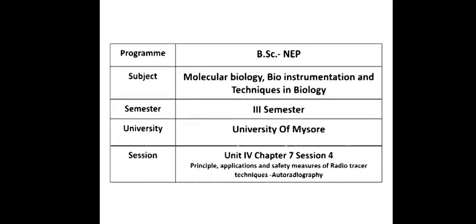Welcome to another session of Unit 4. In this session, we are going to discuss the principle, applications and safety measures of radiotracer techniques, in particular autoradiography.